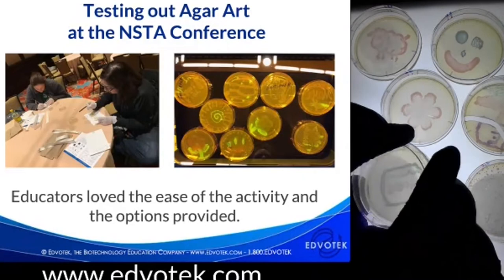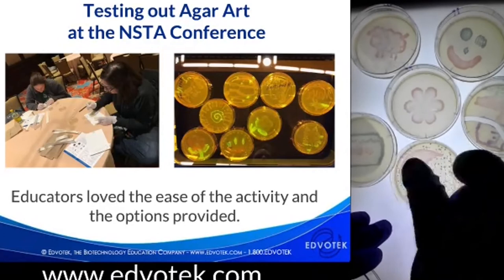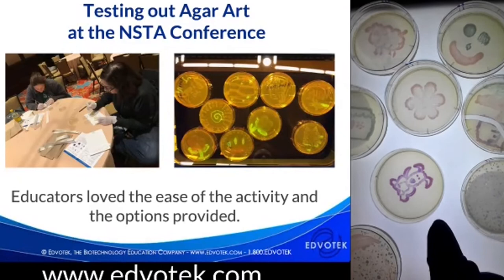This is done with blue and pink. And here is a little starry night scene. So we have a pink moon and then the colonies all around it in the different colors. And so really you're limited by what you can paint. Here is a dog that's pink and purple. So the beads were mixed and you can see the way the edges are, the bacteria grew in kind of an interesting way that expresses both of the colors.